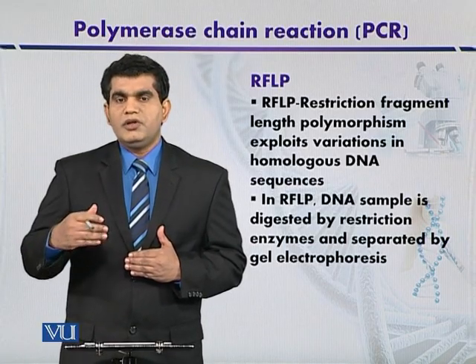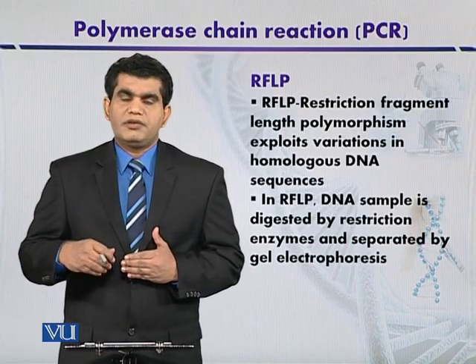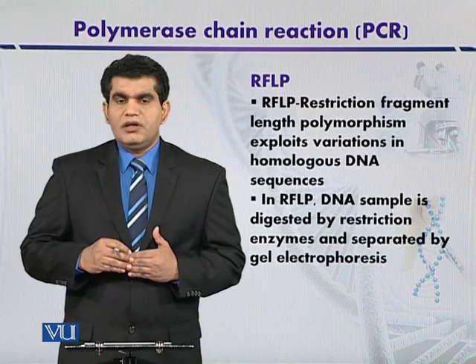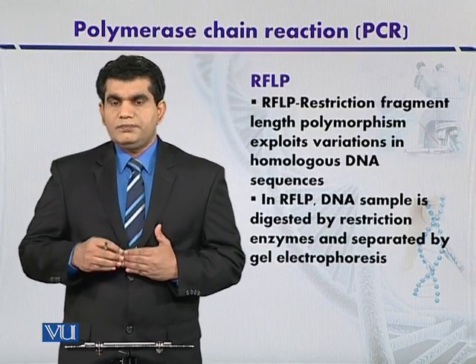We can also use this strategy: the restriction patterns of two individuals can be studied, and due to the 0.1% difference they will be slightly variable.